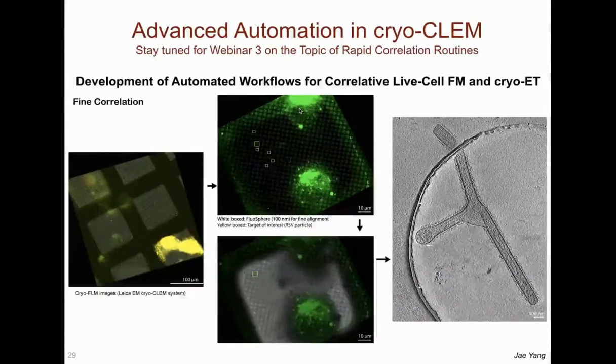This teaser data is of an RSV-infected cell where the native immunolabeled virus particles fluoresce green. In the cryo-ET reconstruction, we resolved the structure of the virus particle that was identified on the cryofluorescence microscope map. Of note, the label used was fluoronanogold, and we are able to resolve the nanogold particles associated with the F or fusion glycoprotein on the surface of the virus particles.